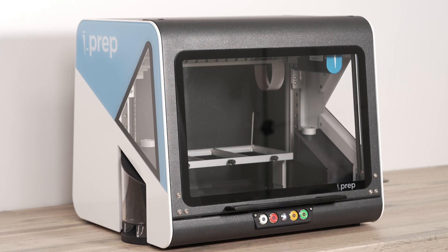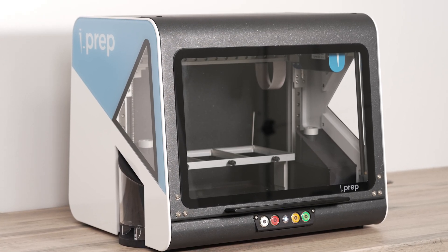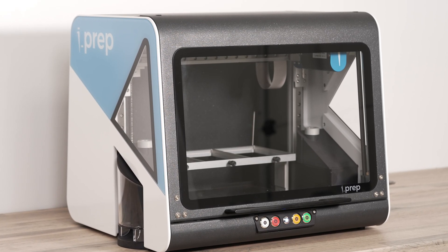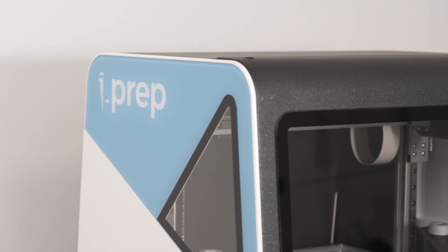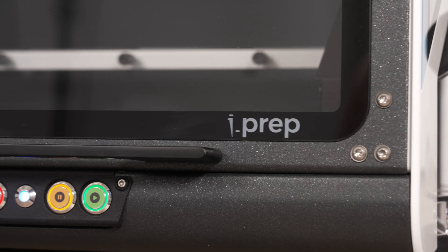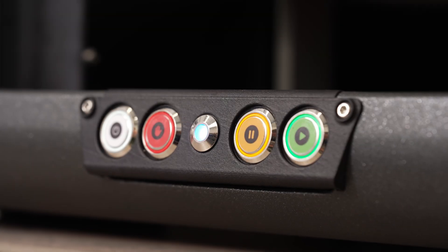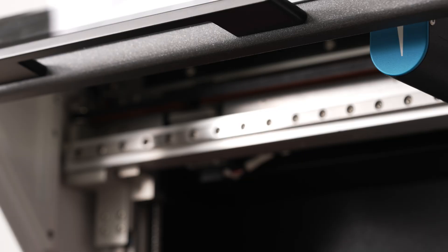Introducing iPrep. iPrep is an automated pipetting system unlike typical liquid handling systems. It sets itself apart in terms of its size, affordability, and ease of use.